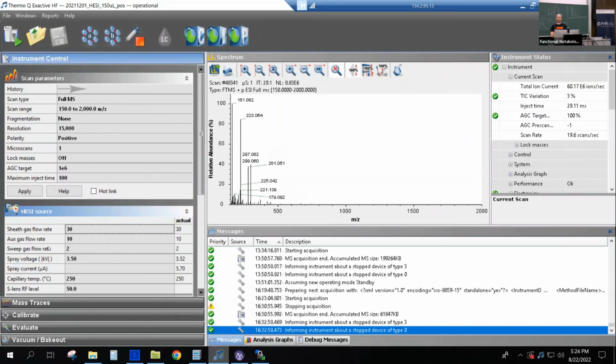Cool. All right. I guess if there's no more questions, then hopefully there's some. Oh, Stefan? Just a rough guideline, higher RFs for higher masses? Yes, in our experience, yes.